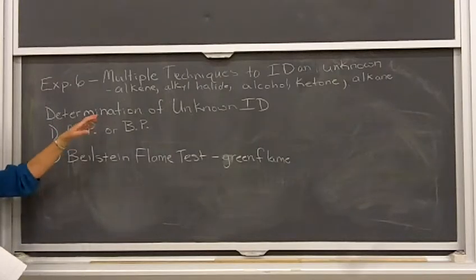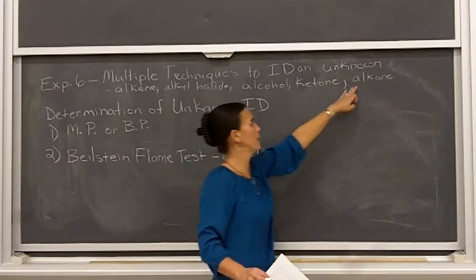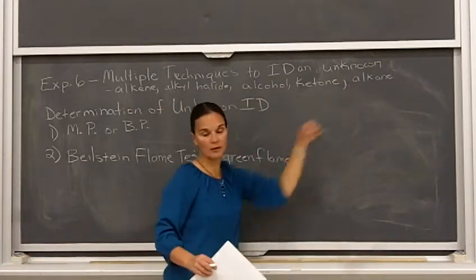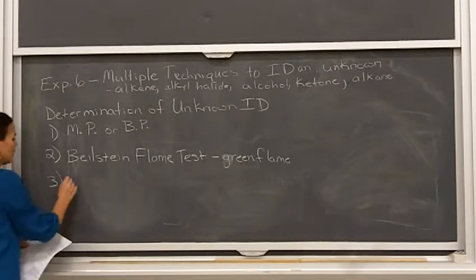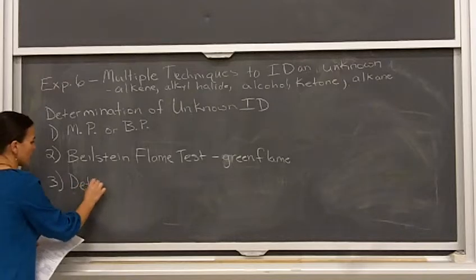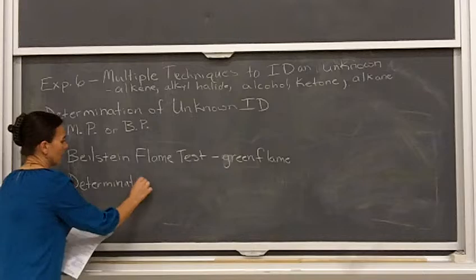And that's going to be the only way you know the difference between the alkyl halide or the alkane. So you want to make sure you get a really good flame test. Make sure your results are reliable, okay? And so we'll show you how to do that in lab this week as well. Next thing is we're going to figure out what our unknowns are soluble in or not.